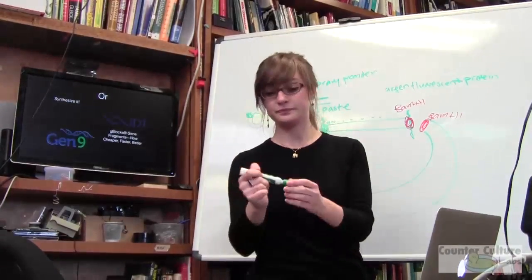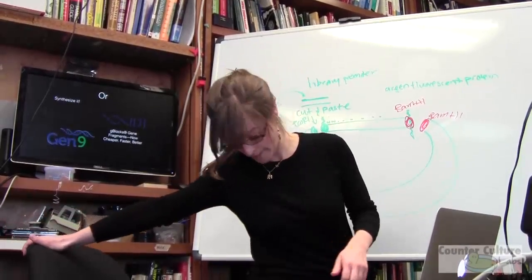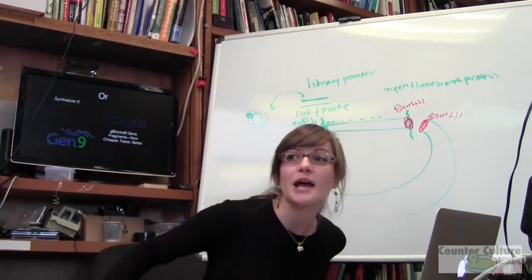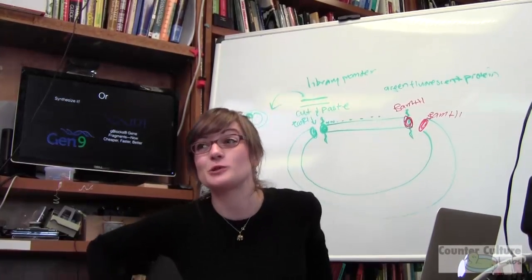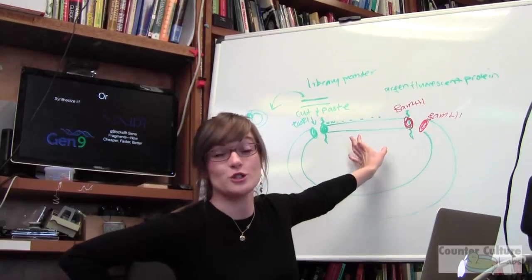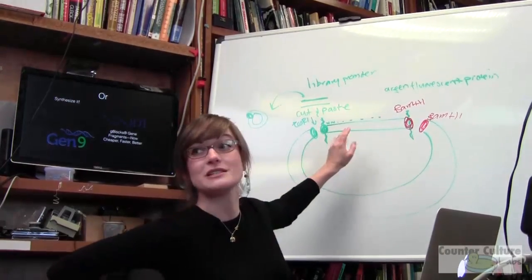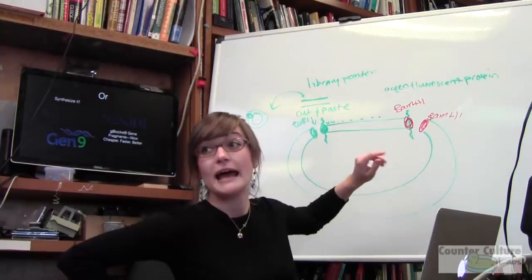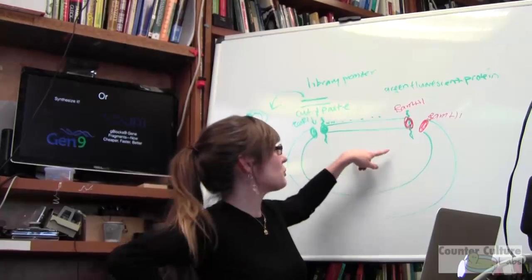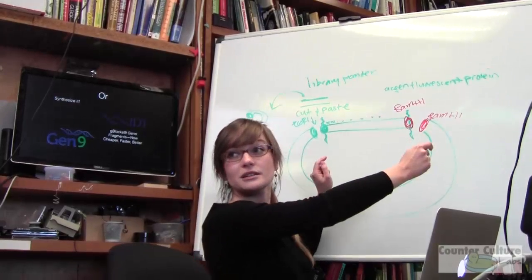The synthesized piece, the straight part. Does it end with, like, can you choose what it ends with? Bingo. Yeah, you hit on an extremely important point. So when you get your gene synthesized, maybe something to consider is maybe you just don't want start codon to stop codon of your gene. Maybe you want a little extra sequence that has restriction enzyme sites at the end, right? Now, if you didn't do that when you synthesized your gene, you can do what Matt was saying, and you could just order primers to amplify up your synthesized gene with restriction sites on the end, right?